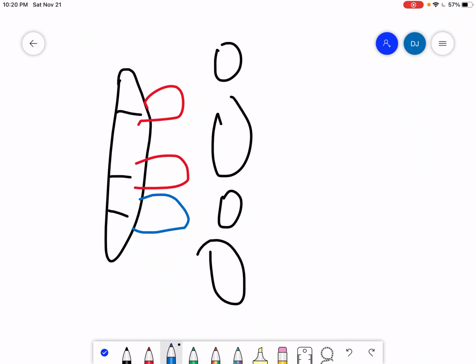We don't just do stuff because we want to do them for fun. Everything actually has a reason, so it's good that you know the reason. Just like, analogous to knowing a proof in math for a formula. So essentially what happens is that these fragments get broken up. And now, how do we actually separate these fragments?